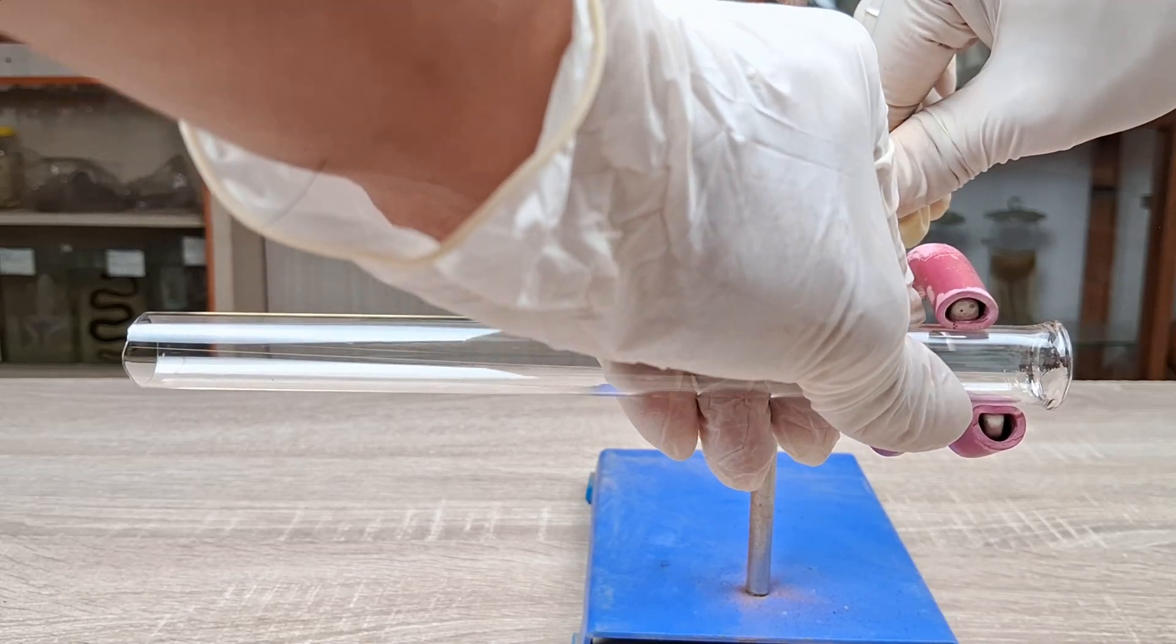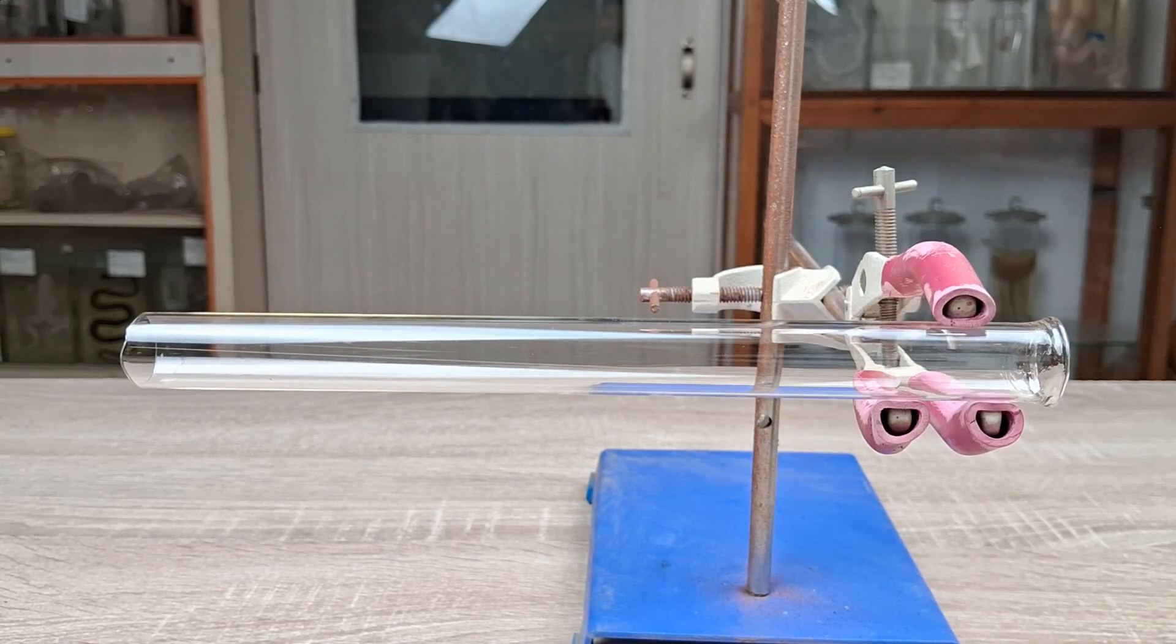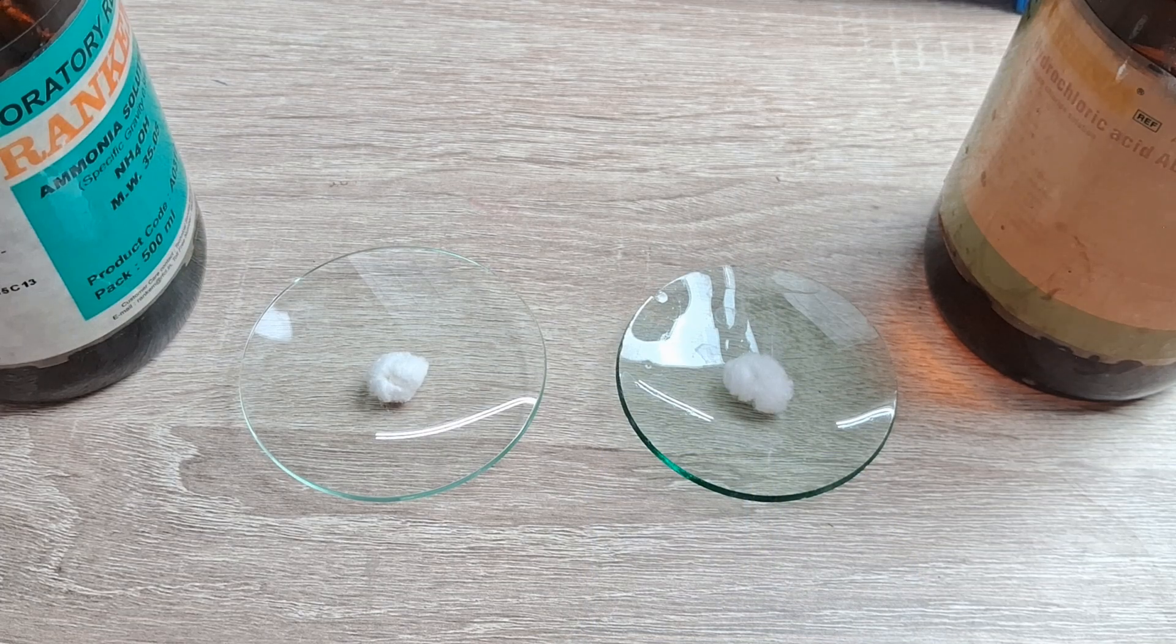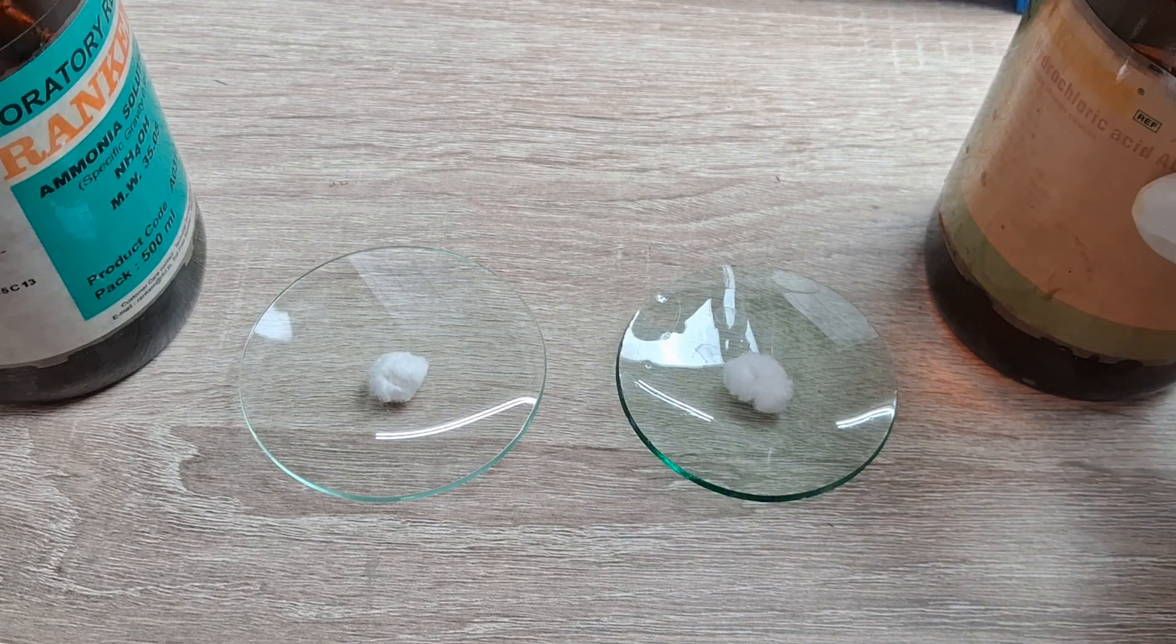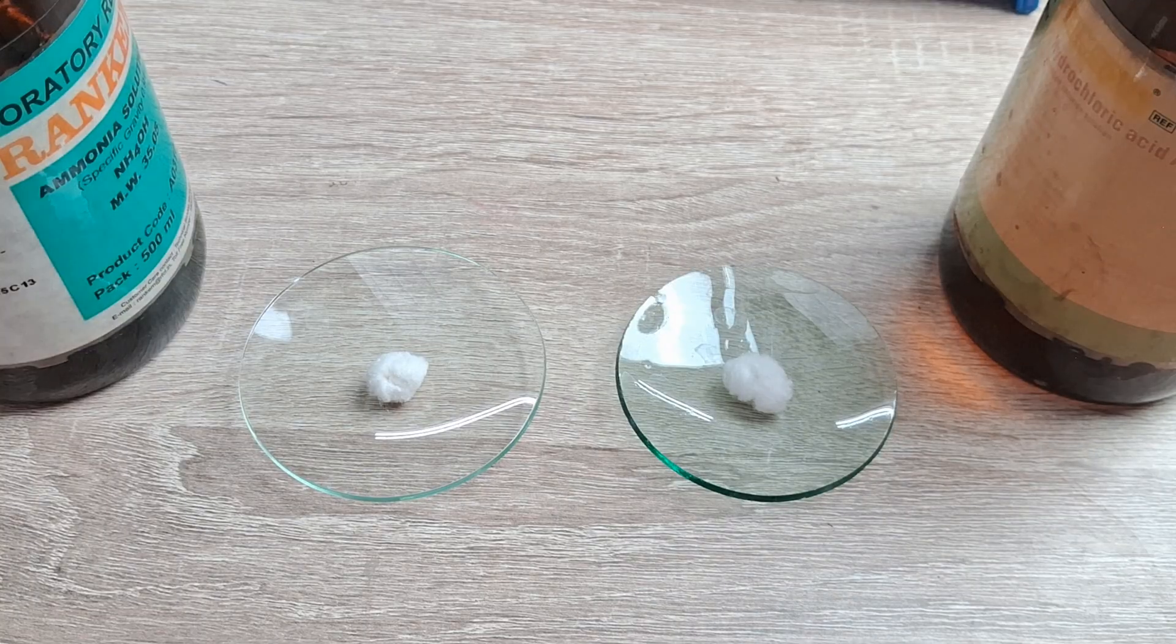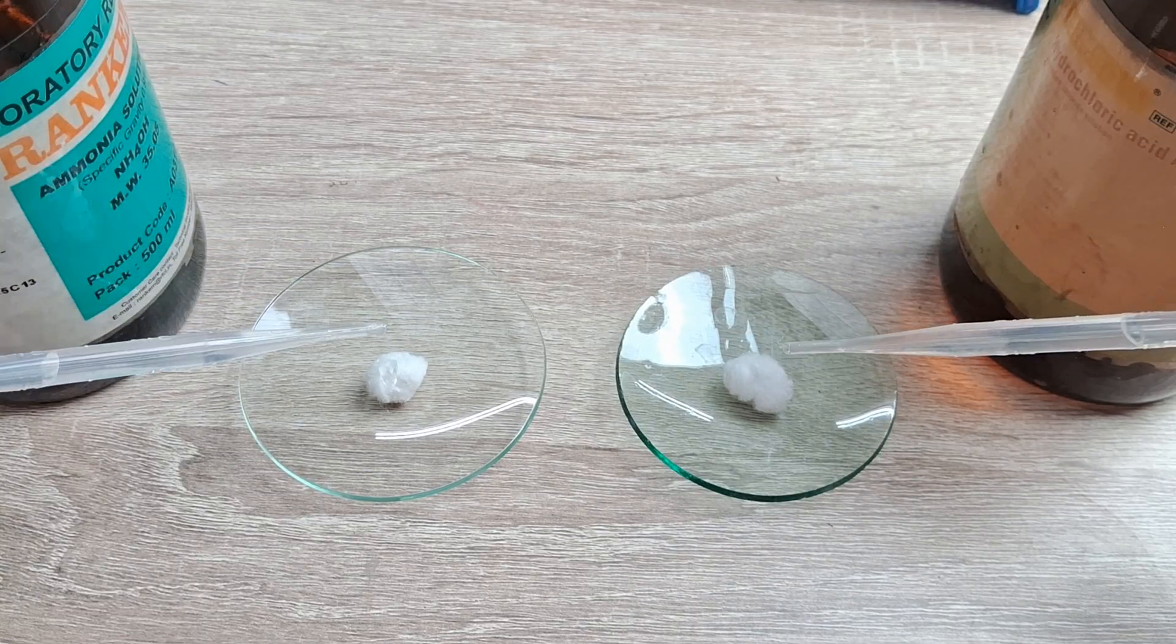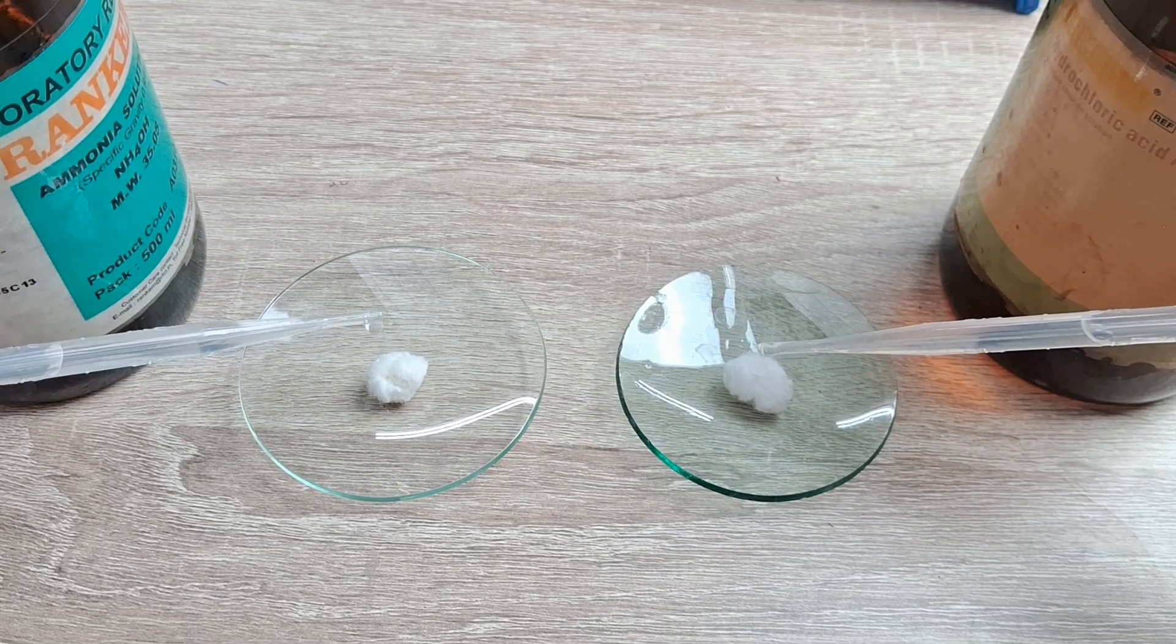Next, take the cylindrical tube and fasten it on a retort stand using a finger clamp. Now, take two cotton balls in two watch glasses or petri dishes and add several drops of ammonia and hydrochloric acid to each cotton ball using the droppers.